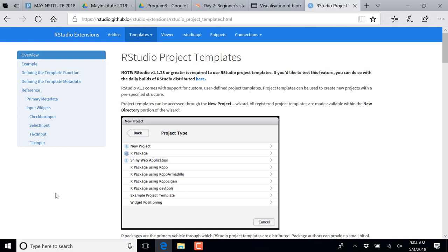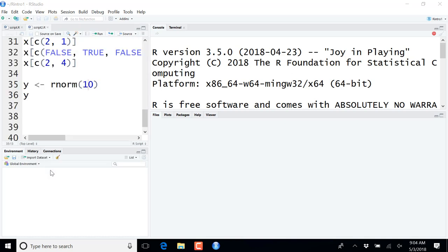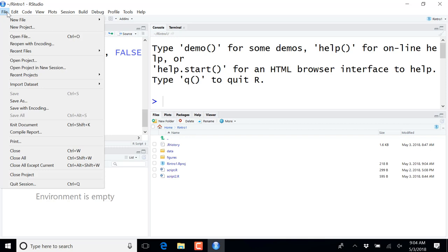So the next thing I'm going to do is to restart RStudio, unless there are any other questions? So I'm going to restart RStudio. And now, RStudio, okay. So apparently it automatically starts where I closed it yesterday, or actually this morning.